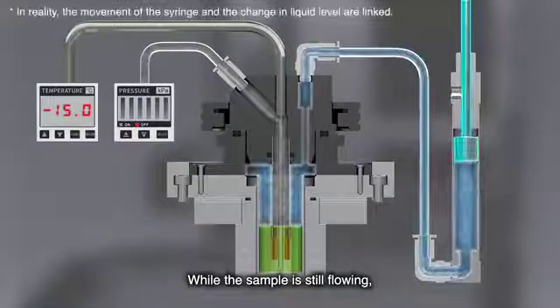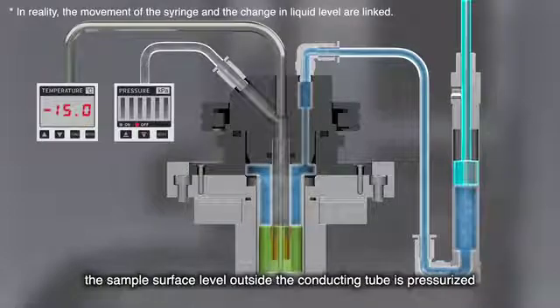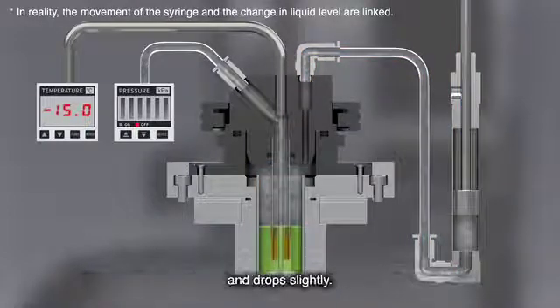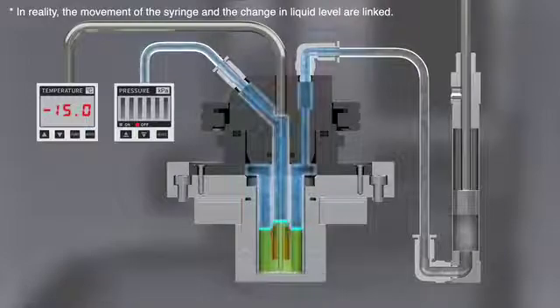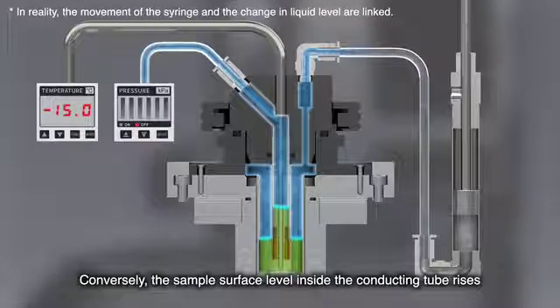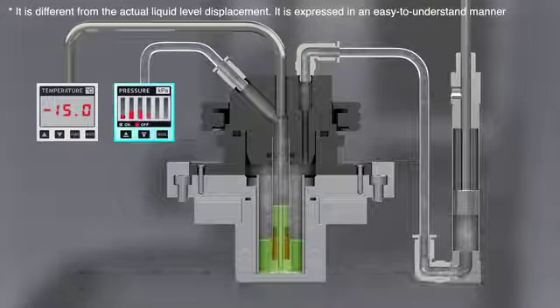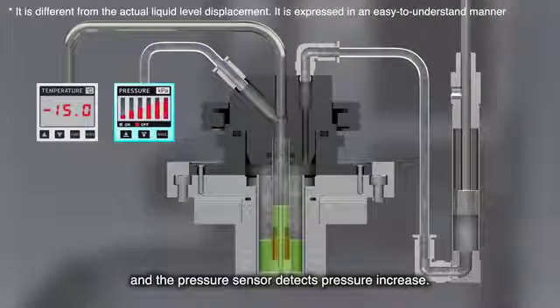While the sample is still flowing, the sample surface level outside the conducting tube is pressurized and drops slightly. Conversely, the sample surface level inside the conducting tube rises and the pressure sensor detects pressure increase.